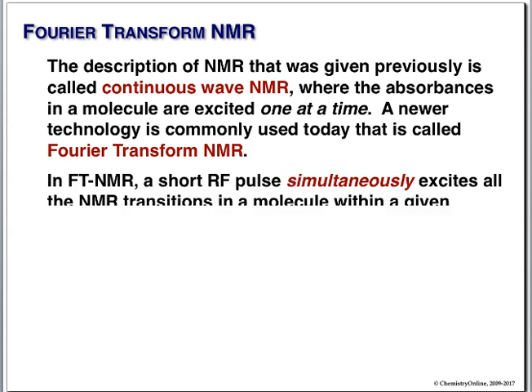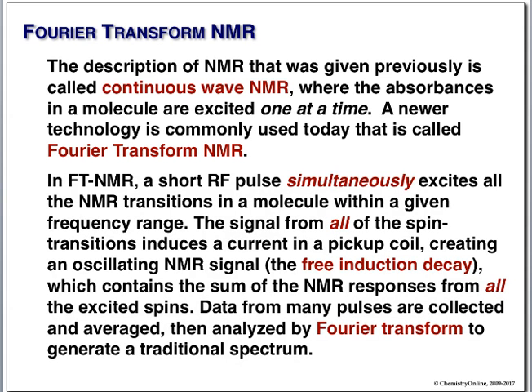FT NMR, this is what you use in C13 all the time. What you do is you blast your compound with a broad range of frequencies. You excite everything.